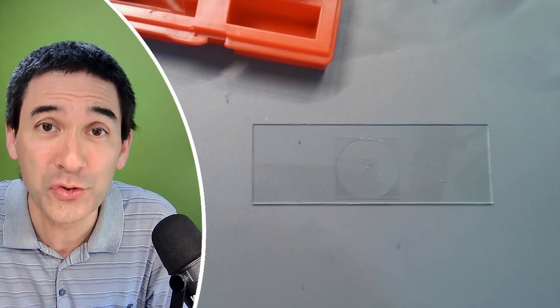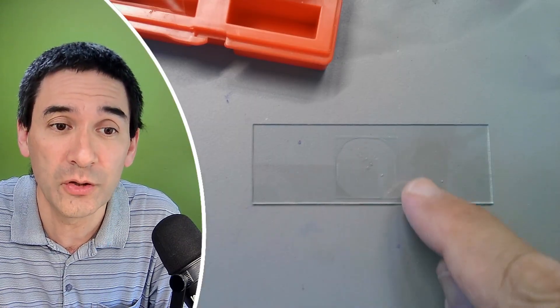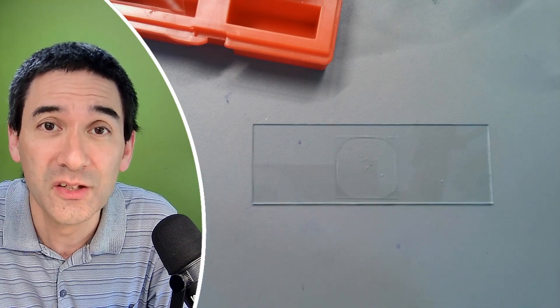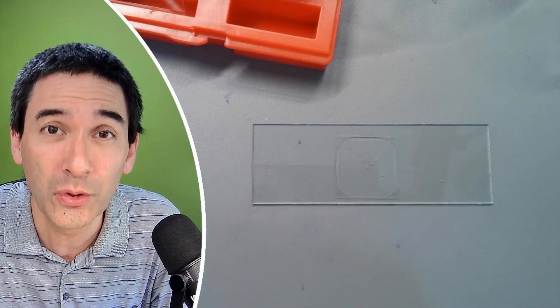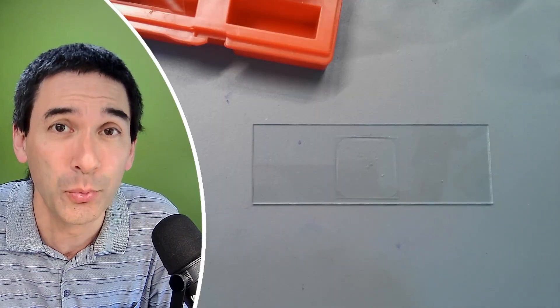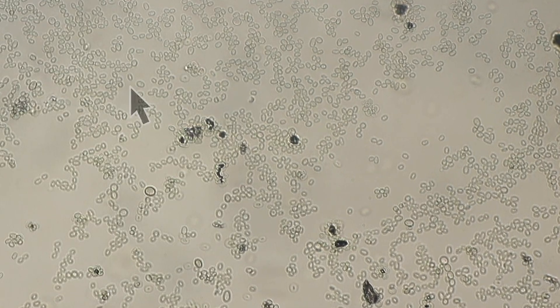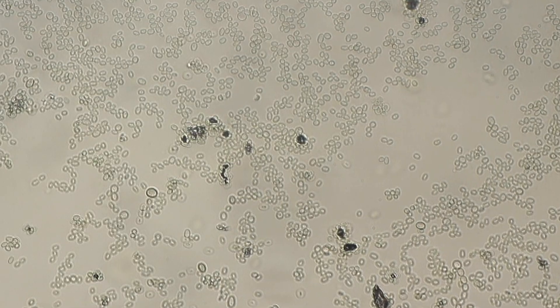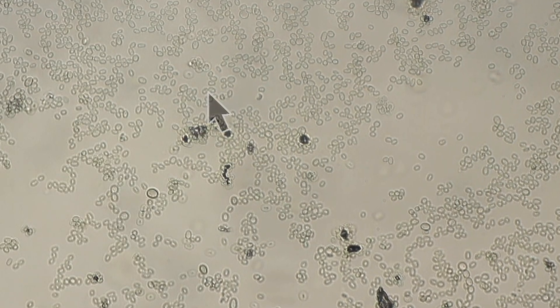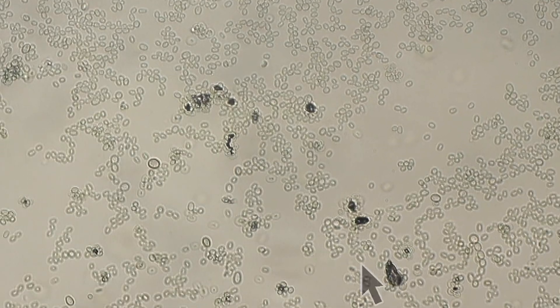However, I'm going to put it under the microscope right away. Please always be careful that if there's glue coming out on the side of the cover glass, that this glue does not touch the objectives of your microscope. So I'll be working with reasonably low magnifications, and we should still be able to see the spores. I'm now using my 40x objective — those tiny, almost transparent oval structures are the spores of the fungus. You see the contrast is not very high, and some of them might still be together in clusters.